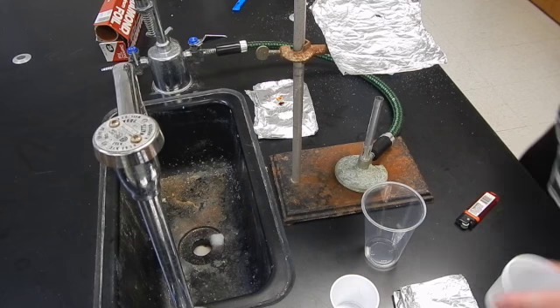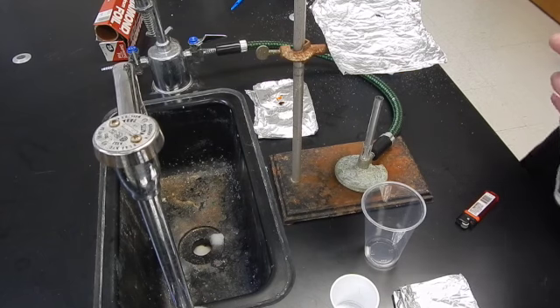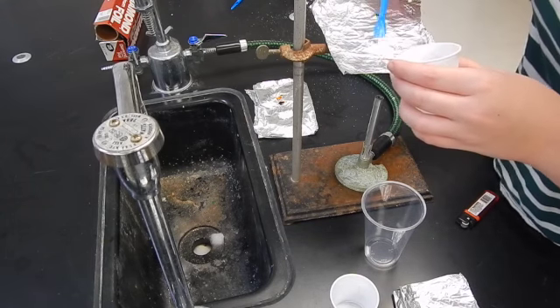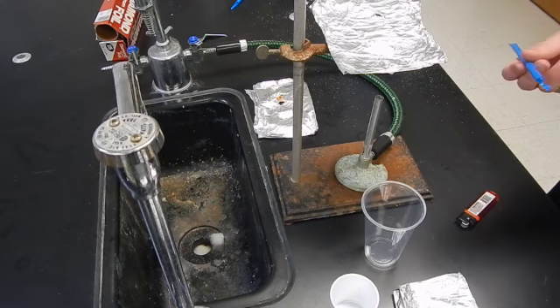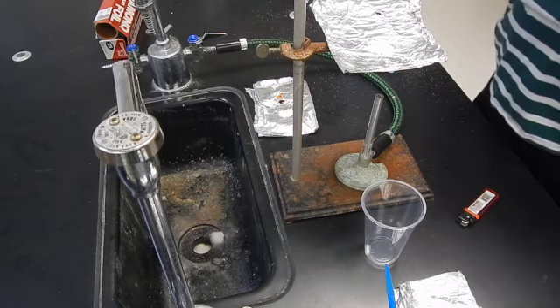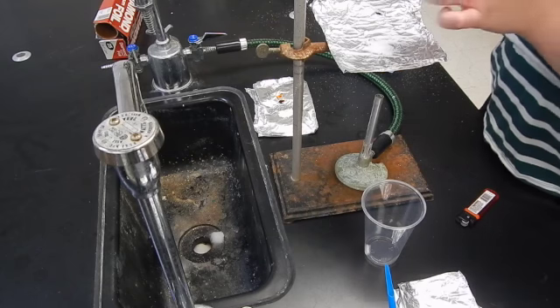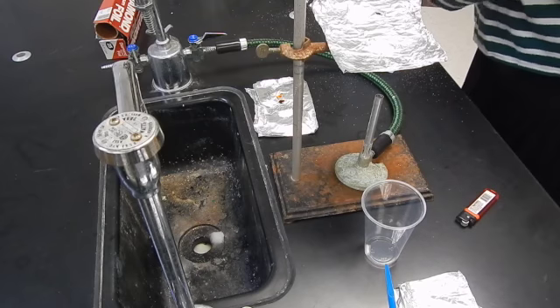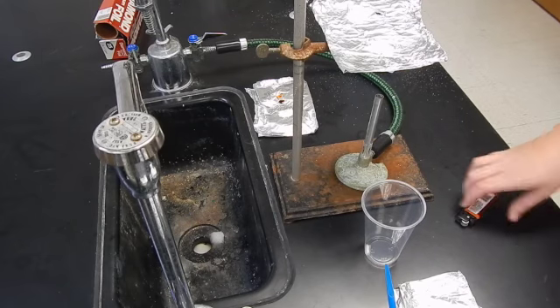I'm going to put unknown 3 on the left side and unknown 4 on the right side. Go ahead and light the Bunsen burner.